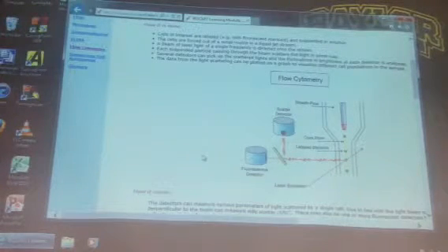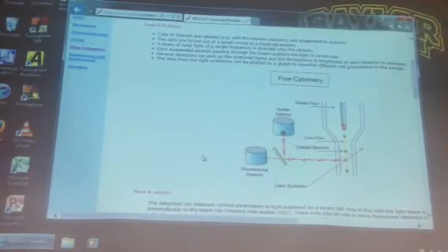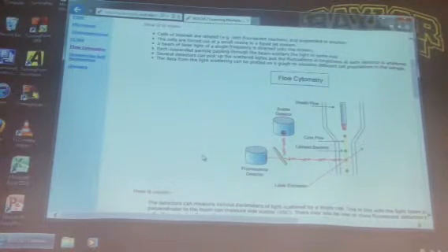The basic idea here is that you want to take individual cells and do a measurement on every last cell. You want to do a fluorescence measurement on every last cell. So what that means is, let's say that you're taking Lake Waco water, which is a wonderful pea green, and it has lots of different microorganisms.